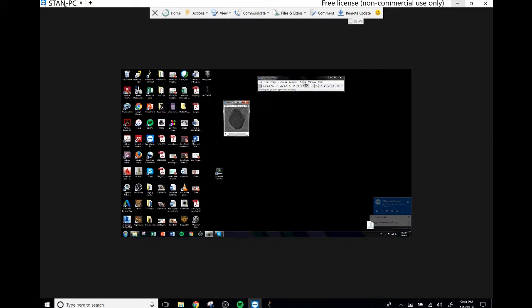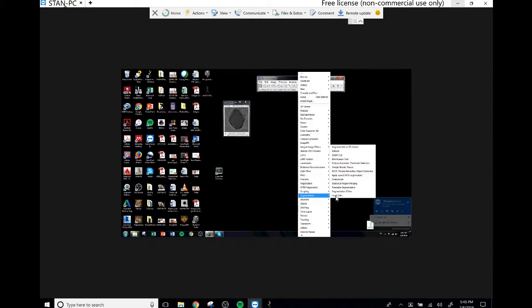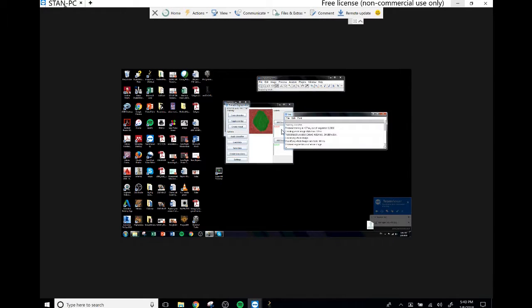Folks, I apologize, this looks like trash, but sometimes if the shoe fits. So there it is, the option for trainable segmentation. I'm gonna do the classes here. This is gonna be class 2, that's the stuff we want to keep, and then this is class 1, the stuff we want to remove or switch to black. We're gonna train the classifier, and that's how it's done, baby.